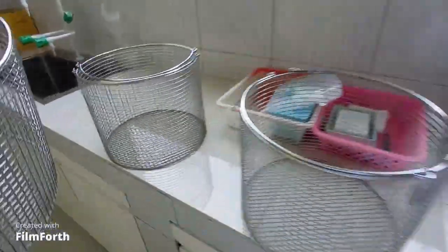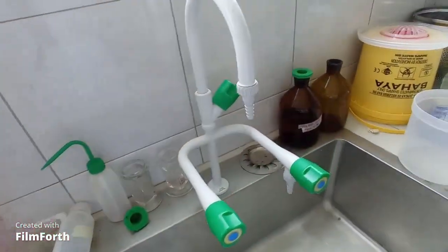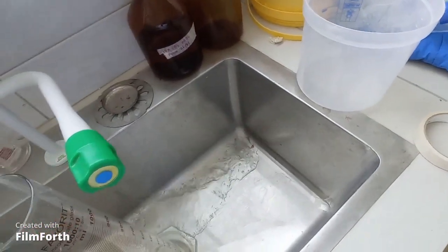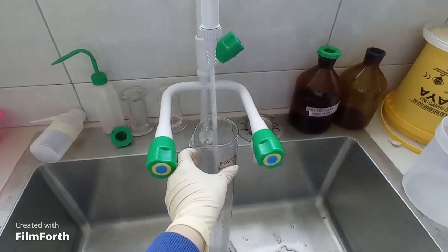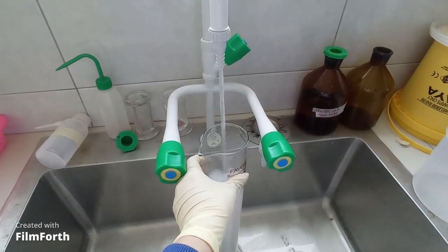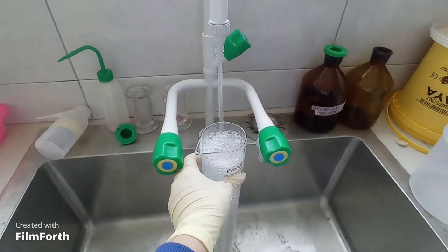Now we will ready our machine. To start the machine, first we have to take some steps. I took out the bucket, and now I am taking some water in a measuring cylinder. You have to put some water in the machine so that it can make steam. Basically the autoclave machine works on high temperature and pressure to sterilize the stuff, so I am pouring some water.